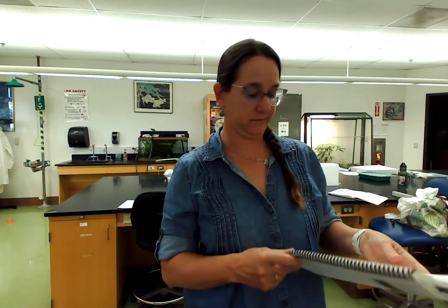So we're going to test for lipids. We have 2 tests to do for lipids. One is called a grease spot test. The other is a solubility test. We're going to run another test, testing for simple sugars with a test called Benedict's test. It's kind of fun. We're going to do a test for complex carbohydrates or starches with iodine. And then we're going to do a test for proteins called the Biuret test, okay?